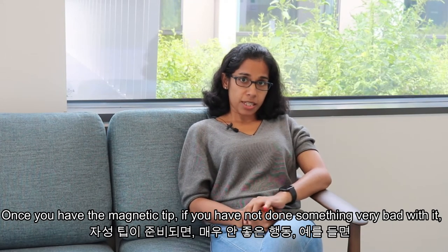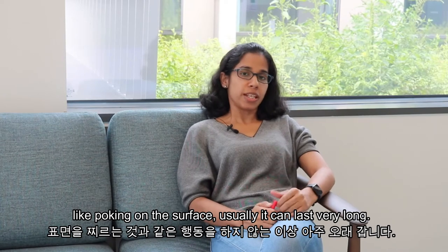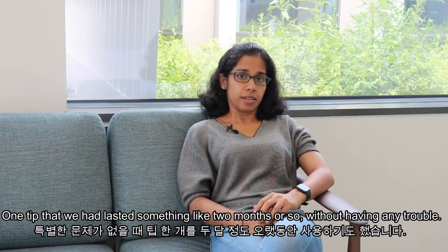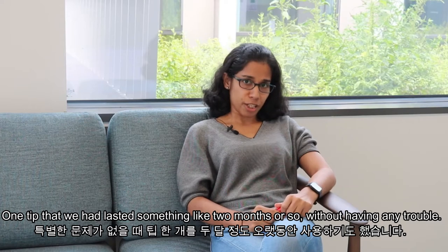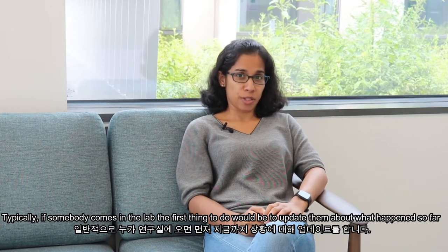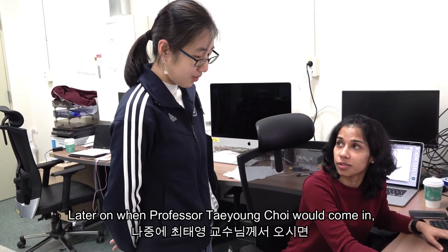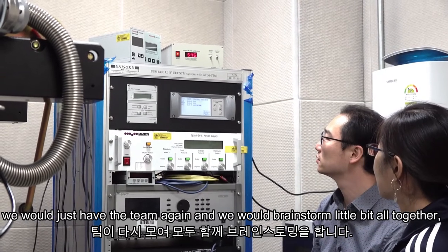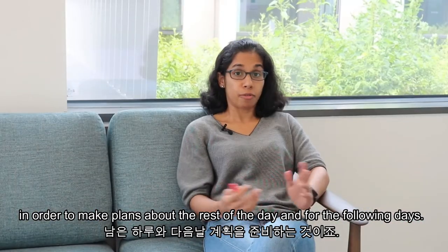Once you have a magnetic tip, if you haven't done something bad to it — like poking it on the surface — it can last a very long time. One tip we had lasted about two months without any trouble. When someone comes into the lab, the first thing is to update them on what's happened so far. When Professor Taeyang Choi comes in, we update him and brainstorm together to make plans for the rest of the day and the following days.